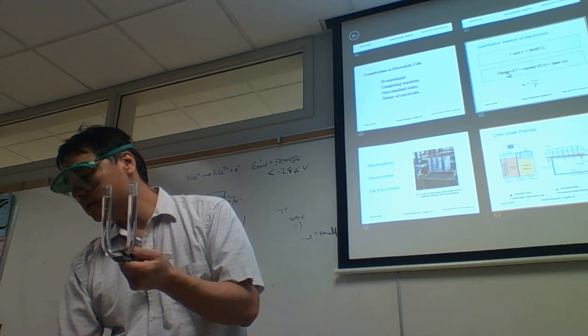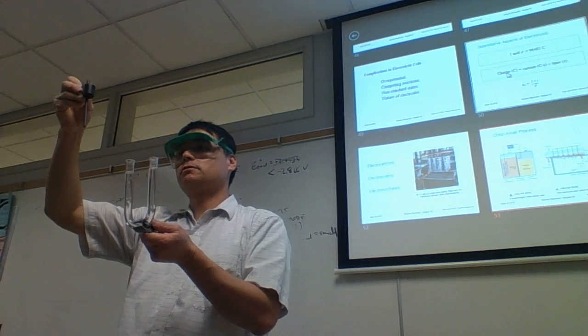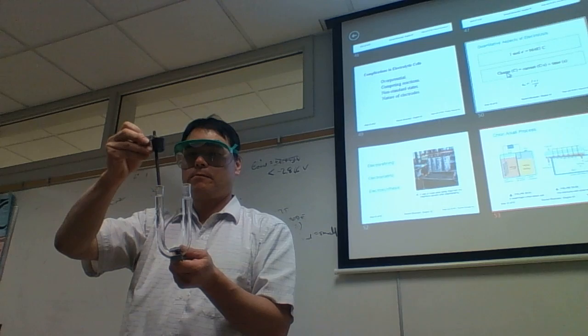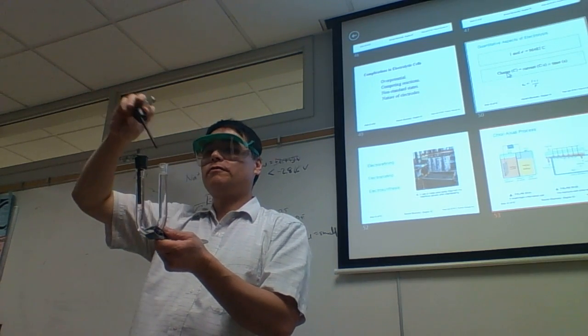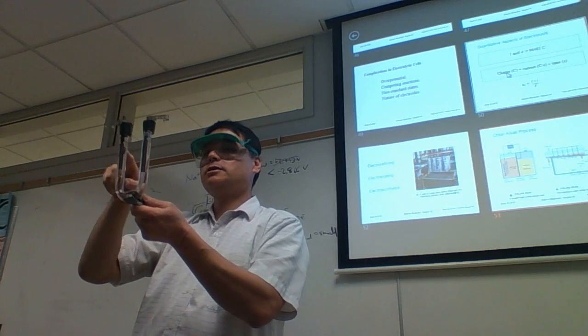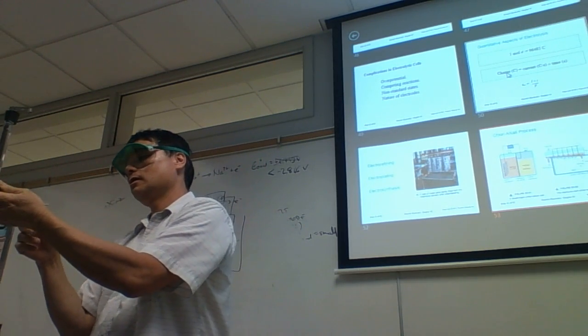And then I'm going to use some inert electrodes. In this case, these are the low budget inert electrodes. This is just graphite here. This is another graphite electrode here. So I just have aqueous potassium iodide and 2 graphite electrodes connected here.